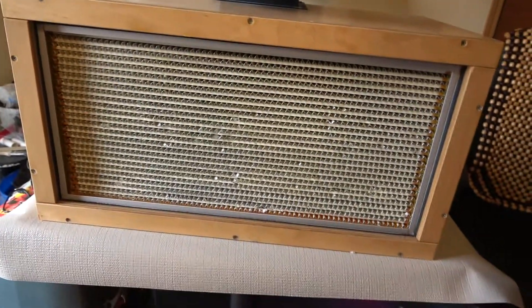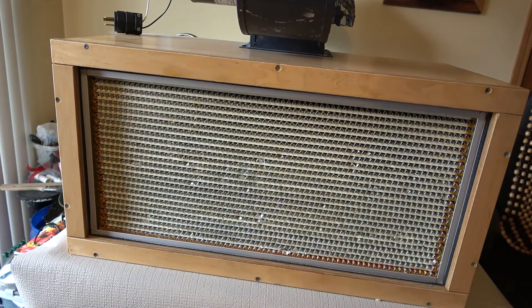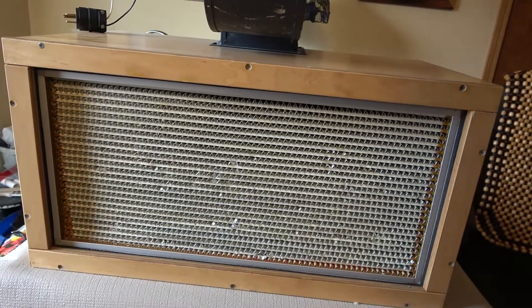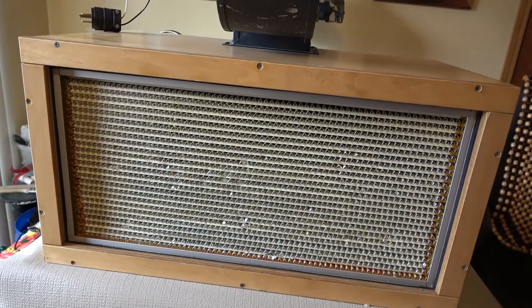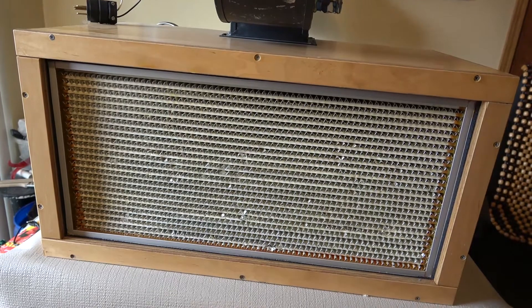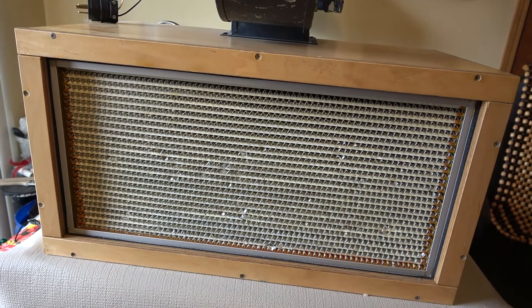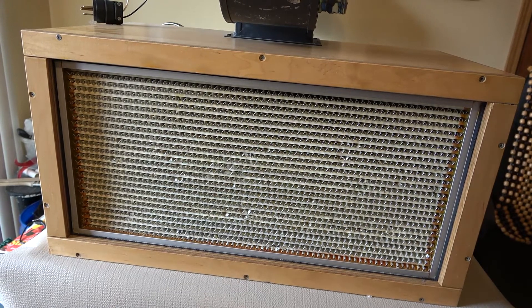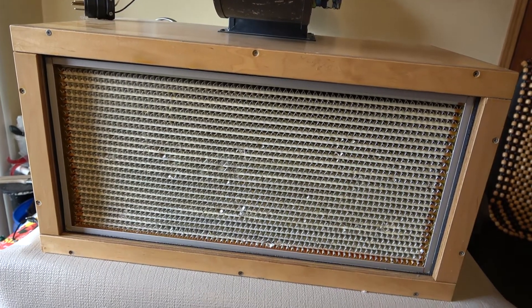I'll also blast the inside of the squirrel cage out too, because I'm sure it has some dust in there as well. Then I'll put it back into the lab room, insert the new filter, and put it all back together. I definitely don't want to be doing that in the lab room or really in my house because it's going to be a lot of dust flying around.